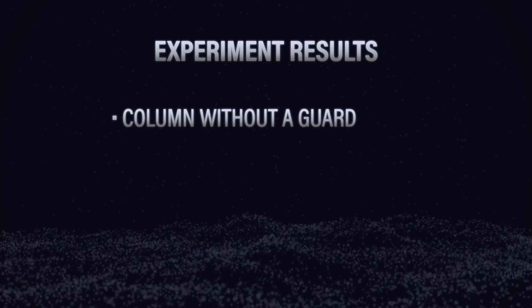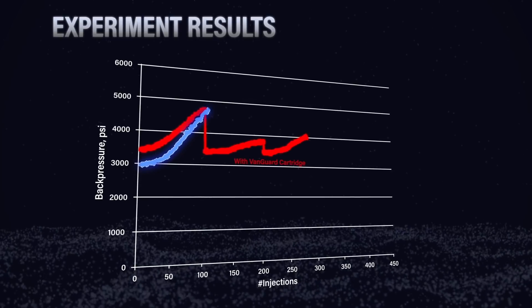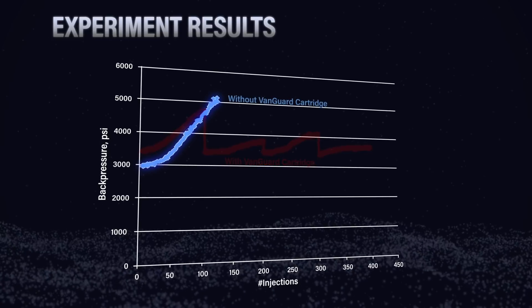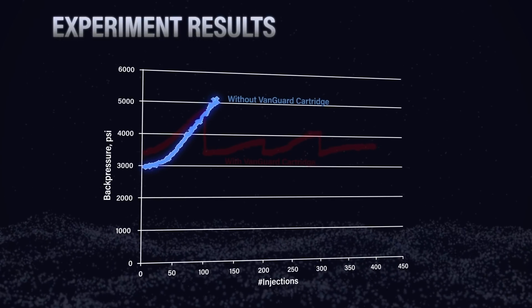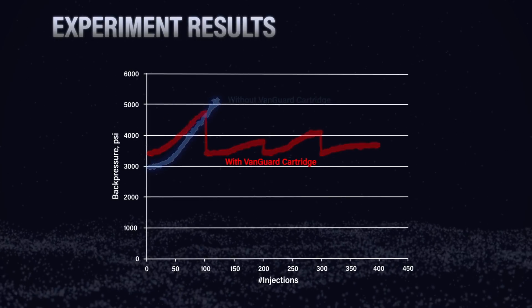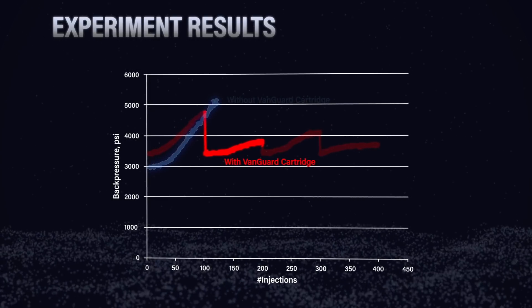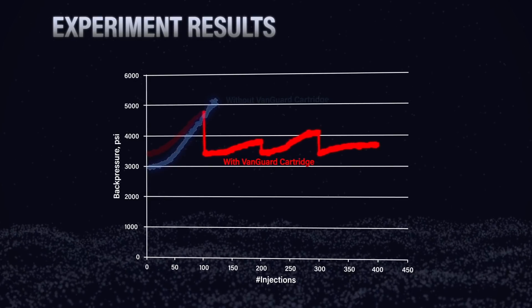What can you tell me about the experiment we ran — a column without a guard and one with a guard — doing big injections of dirty sample on them? So we plotted both columns on the same graph. The column without the guard column saw its pressure go up pretty quickly and the column was just dead — we couldn't use it anymore because it was over pressure. But with the column that had the guard column, we were able to change the guard cartridge and bring the pressure back down to a reasonable level and keep running. Then, once we saw the pressure start to rise again, we changed it again — and then a third time — and we probably could have kept going.